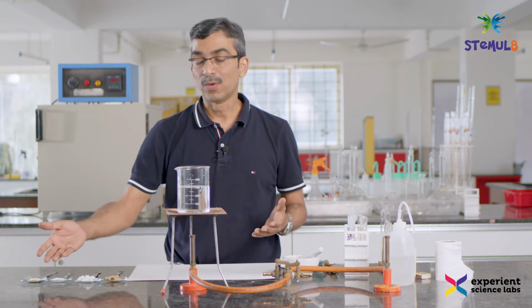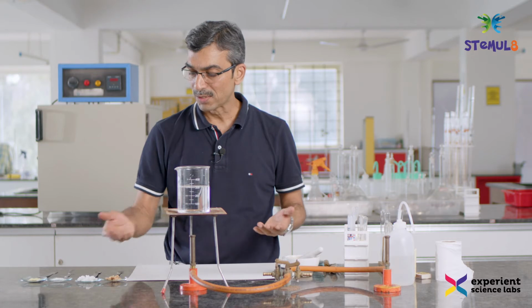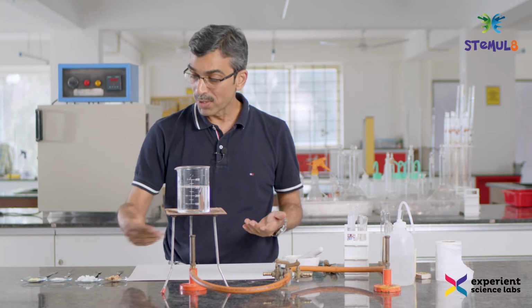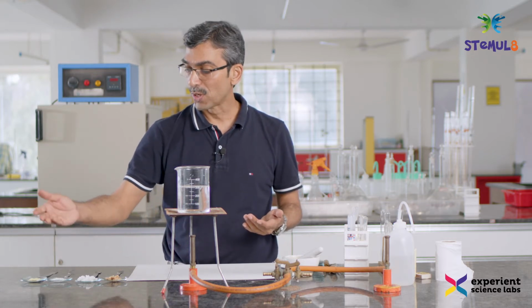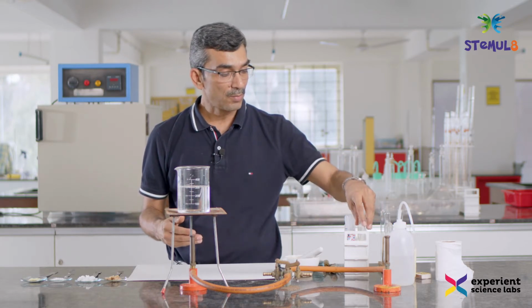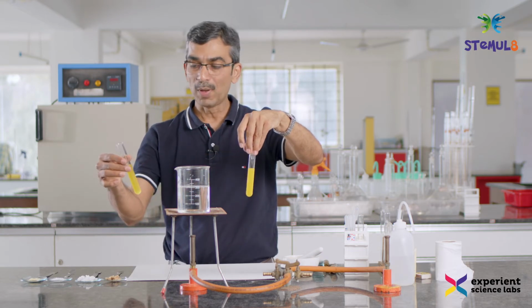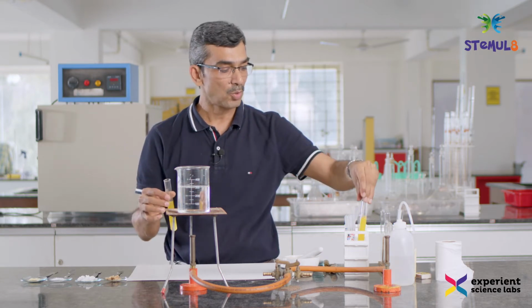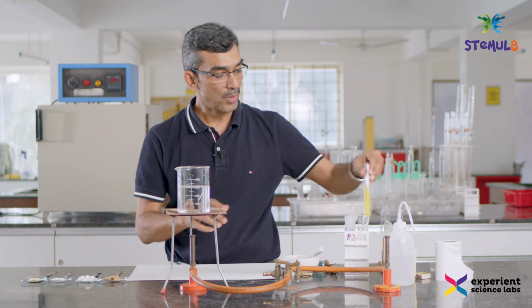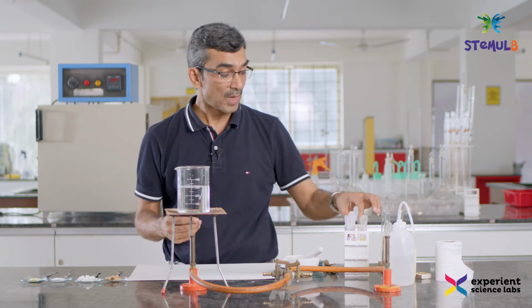First of all, I have a set of food items that we eat normally on a day-to-day basis. I have got ground groundnut, I have got boiled rice, sugar and ground moong dal. Then I have a couple of fruit juices. You may be able to identify them by color. I am not going to name them. I don't want to get into any trouble with any one of them. And the most important things are the reagents.